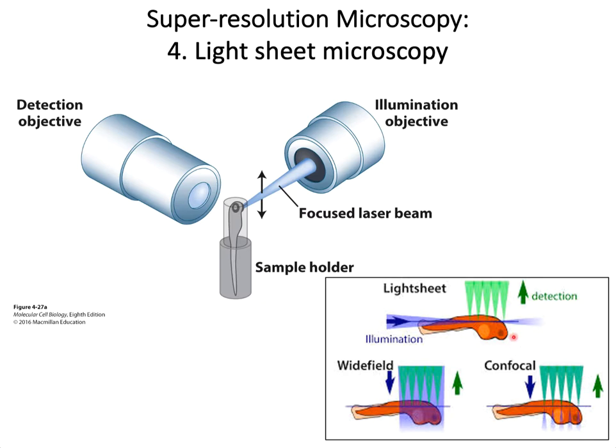In light sheet microscopy, as you can see, a single thin plane of the sample is illuminated, and the detection of the emission light by the objective is in an orthogonal plane, meaning it is 90 degrees from the plane of illumination. This allows the different planes to be illuminated by the laser rapidly, and the emission light is detected by the objective only in the corresponding plane which is illuminated by this light sheet. And rapid collection of these images can produce a three-dimensional dynamic image.